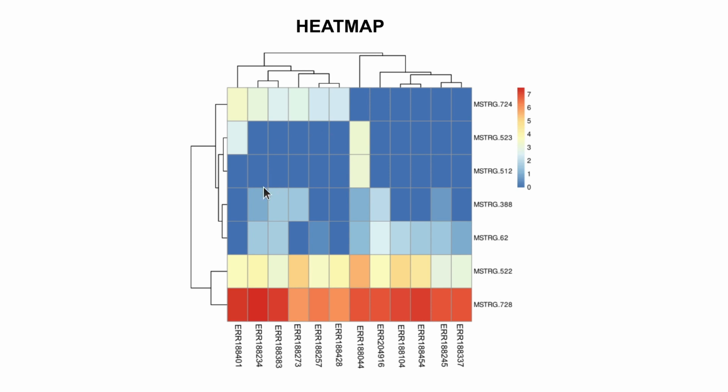Here you can also go further, by using this clustering approach to get a deeper understanding of your data. The same can be used for the samples as well. So heat maps are a great way to interpret your gene expression data, and I encourage you to also use heat maps to do the same with your respective data.